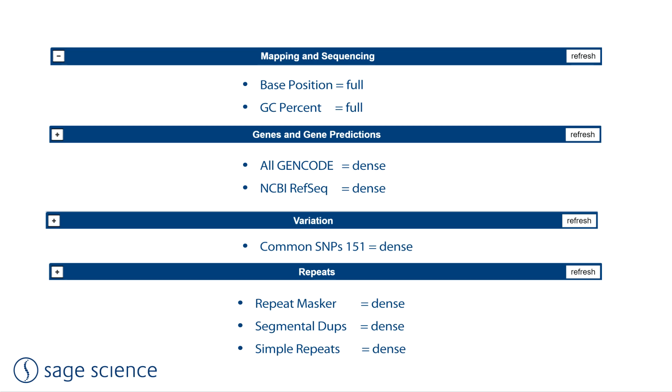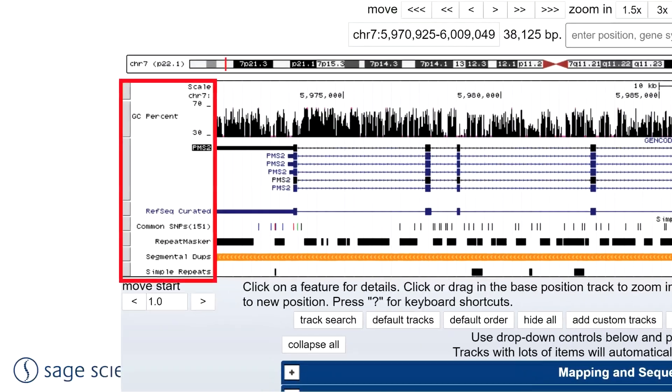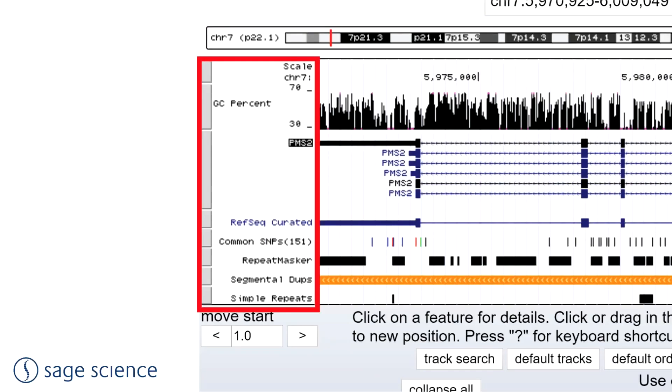For those following the tutorial live, here are the settings again. The final browser display should look like this. We will look for sequence regions that are devoid of repeats and SNPs, and importantly, have balanced GC representation.